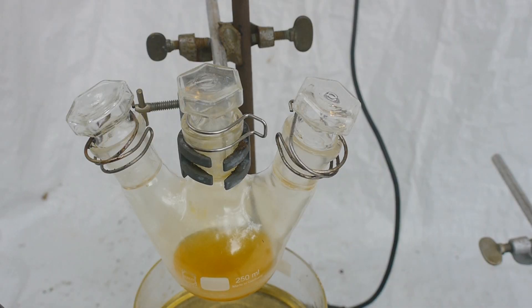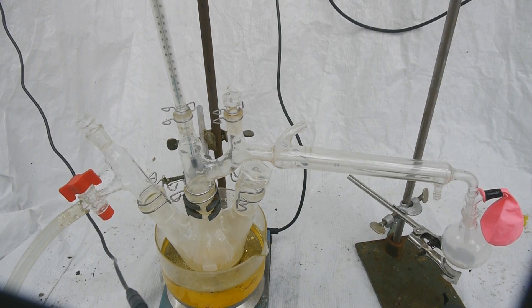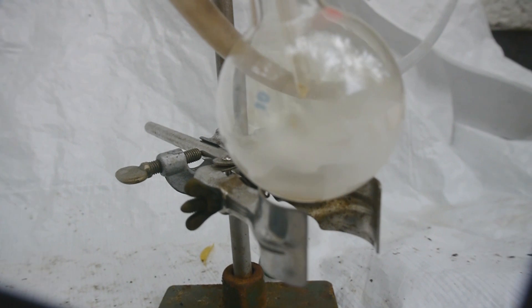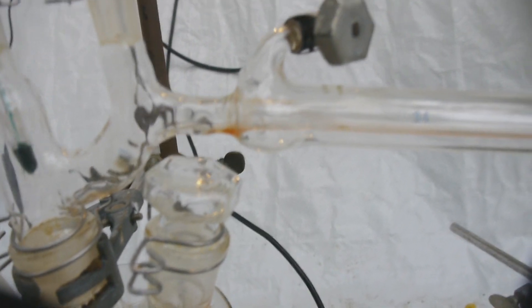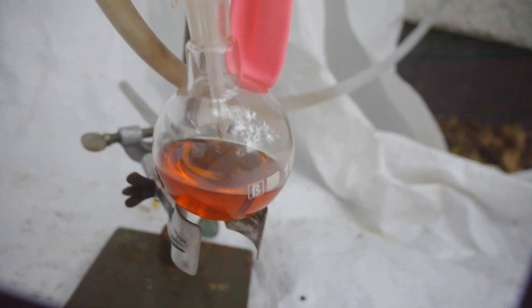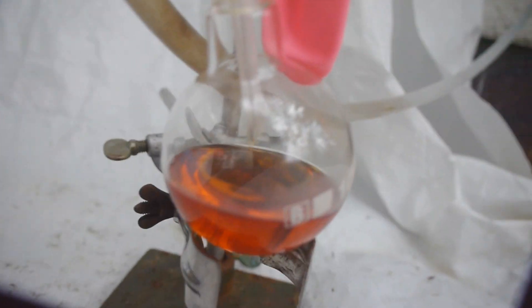In order to purify the titanium tetrachloride, I'm going to have to distill it. Let's just turn the heat on full blast now and see what happens. Now we can nicely see the vapor front of titanium tetrachloride rising up here and our product is condensing — amazing. There seems to be some impurity in the distillation apparatus. I could distill it again to get rid of it, but I think I will just leave it as is, so at least my titanium tetrachloride has some character. I mean, it looks really beautiful, actually.